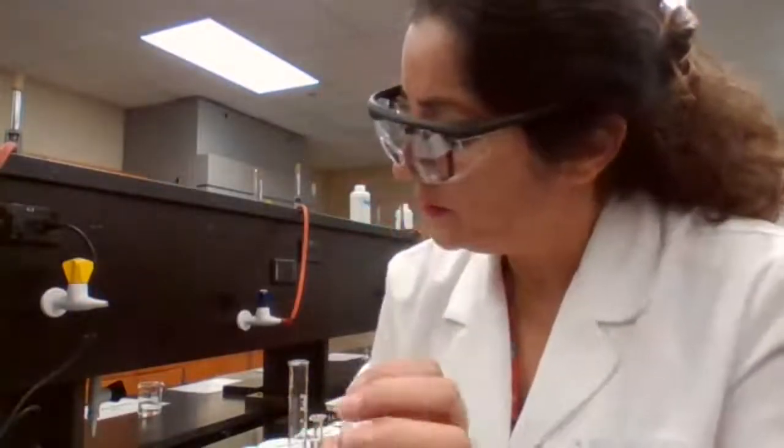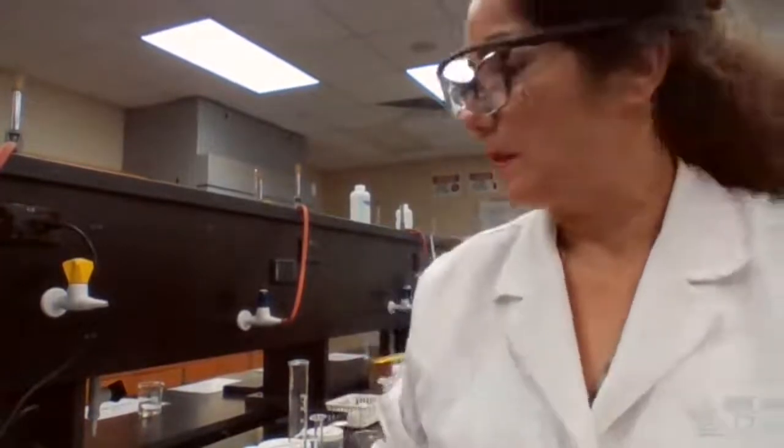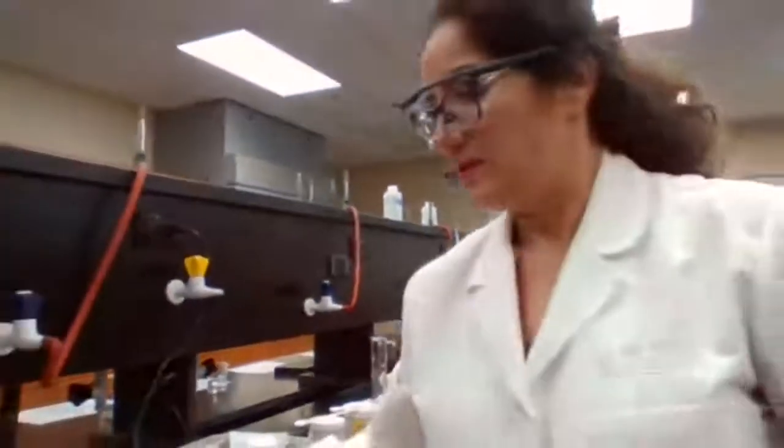After it sits out, now next we're measuring the volume. Basically the volumes are set. I'm going to take the computer to the other side of the lab so we can read these numbers.